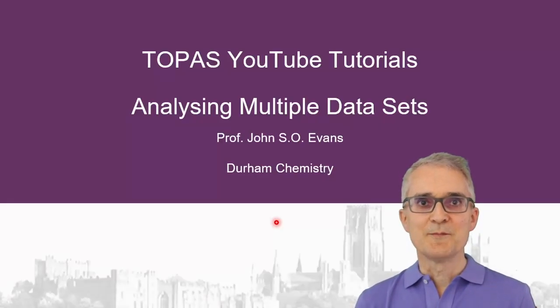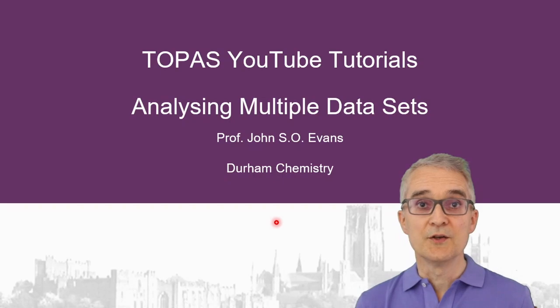Okay, so hello, my name's John Evans. In this video, what we're going to do is look at analysing multiple data sets, multiple powder diffraction patterns in TOPAS, or at least one way of analysing multiple data sets in TOPAS.